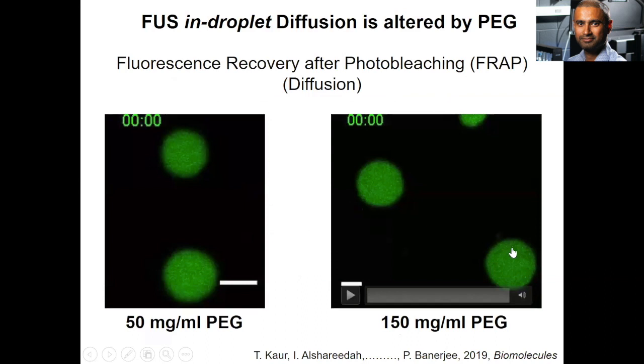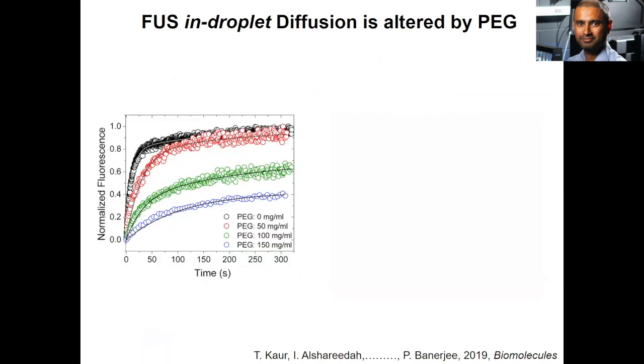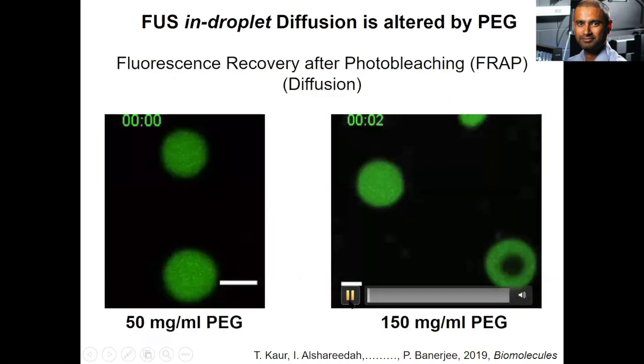So I'm gonna bleach one of these droplets and see how they recover. Let's play the higher crowding first. Okay. And I hope you can see that we created a bleach region, and it's very slowly recovering. It doesn't completely recover even after 5 minutes.